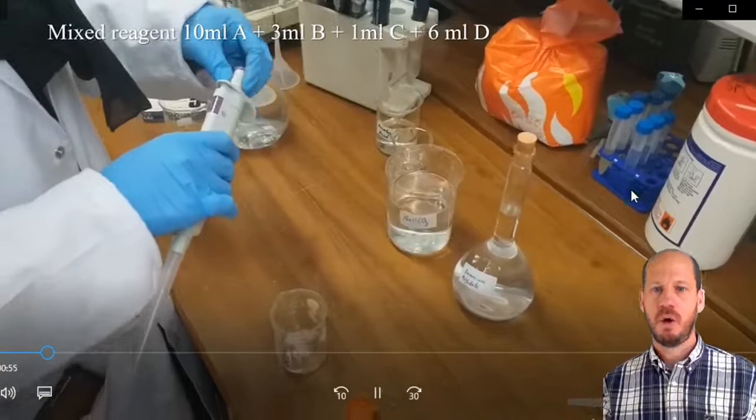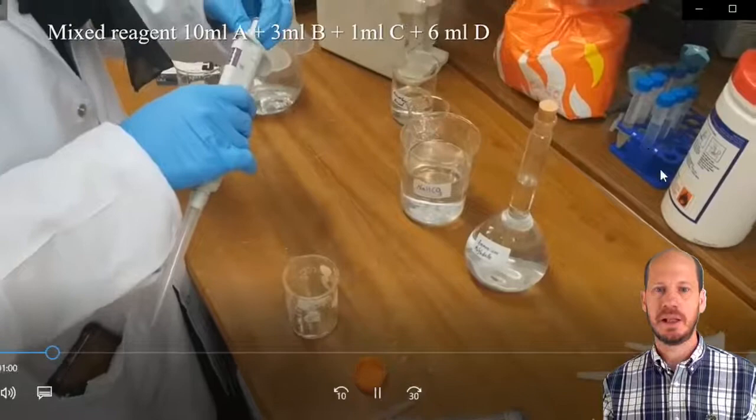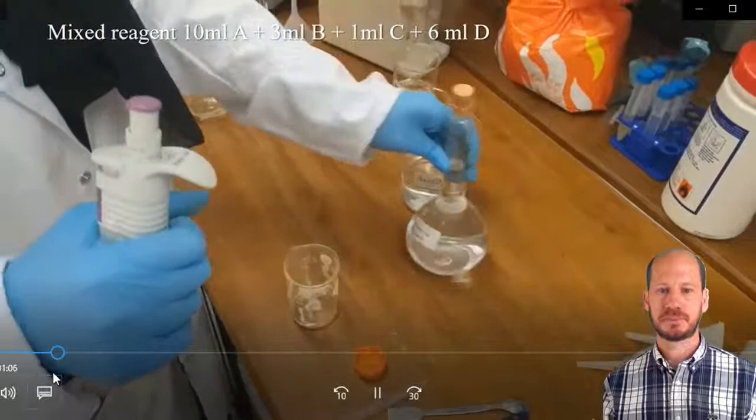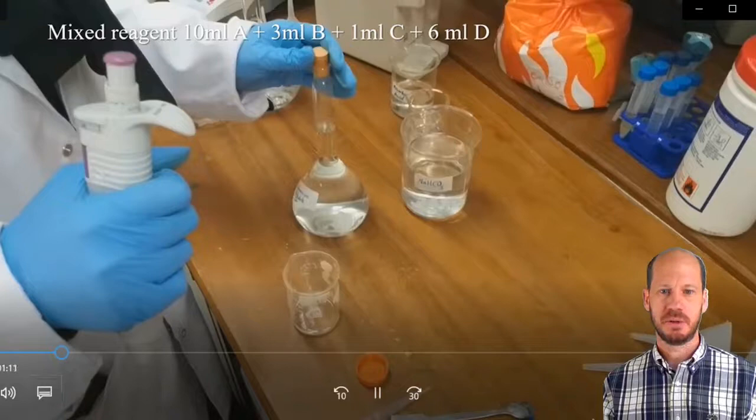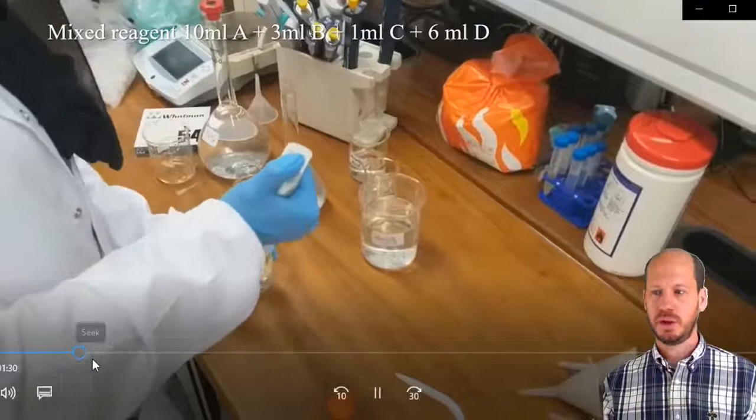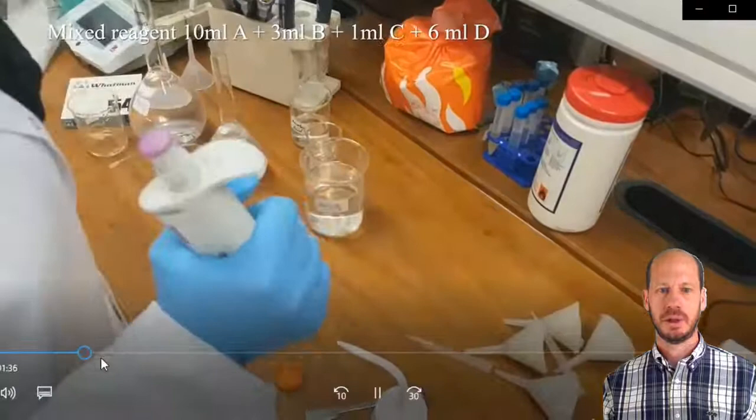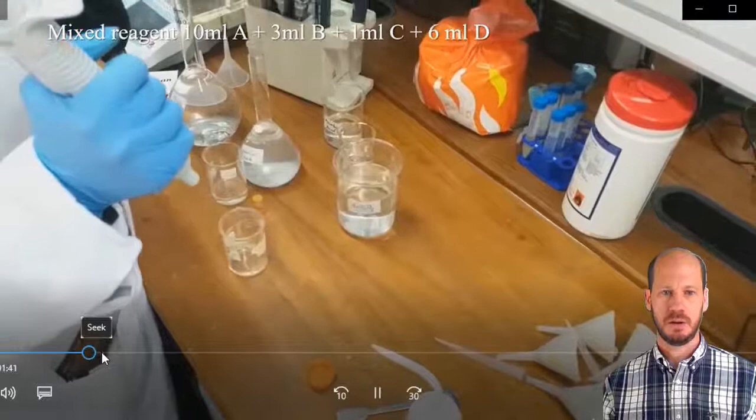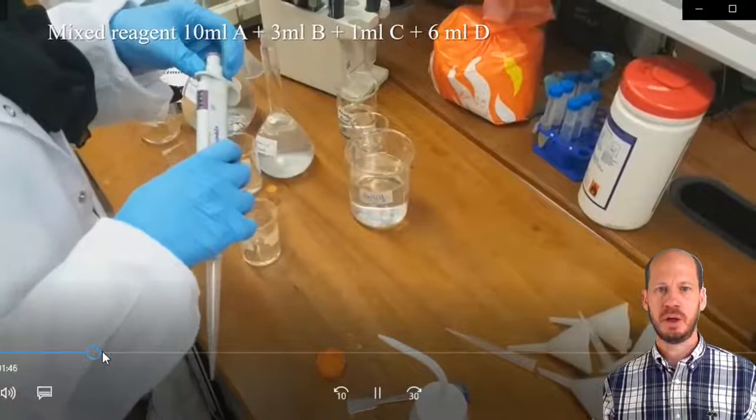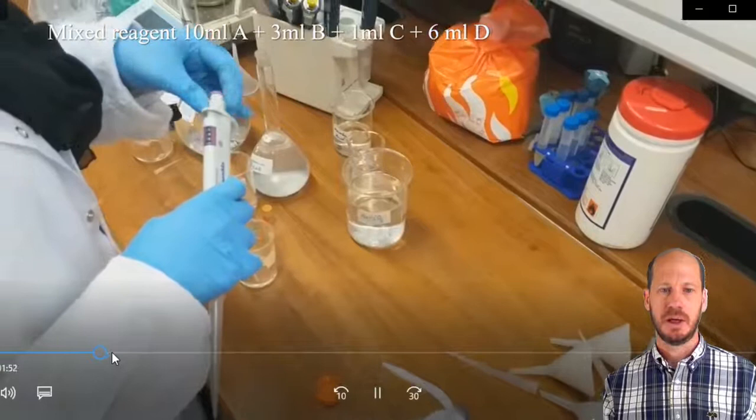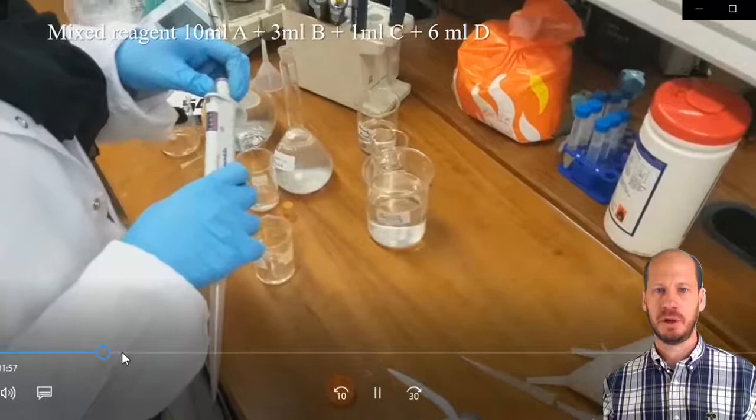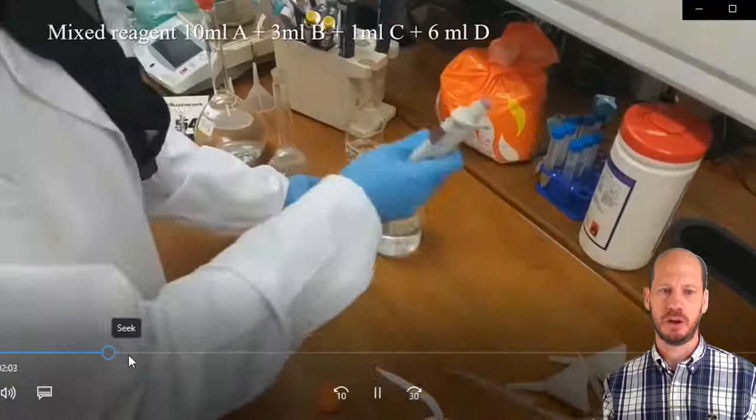The other solutions you can prepare before and keep in the fridge or protect from light, and it will last for months. But the ascorbic acid will spoil, so it's important that you always dissolve solution D on the day you're measuring. Here is Lilua pipetting each solution and making this mixed reagent. It has to be in this order: the acid first, then the ammonium molybdate, then the ascorbic acid. Otherwise, it will not work properly.